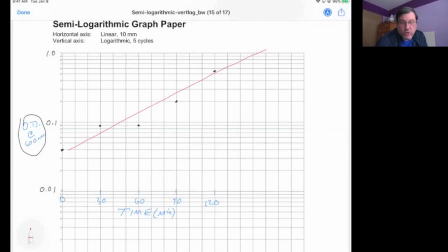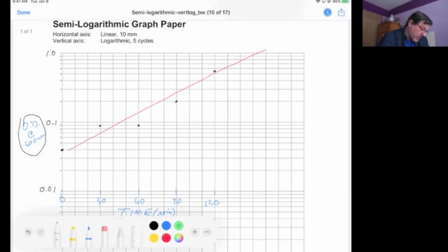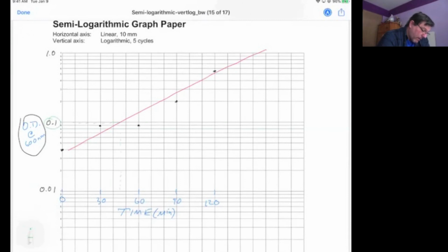And from this, you can do, like we've talked about in class before, figure out generation time. You, again, literally go from 0.1, come across here, come down here, and there's where it's crossing the timeline. 0.1, so twice that absorbance or optical density is, lo and behold, 0.2, which would be right here. So you come across 0.2, you come down here, and that distance, or that difference, is your generation time. So you'll be calculating the generation time of your organism, and you'll also be trying to make a standard curve, and that's what you'll turn in.